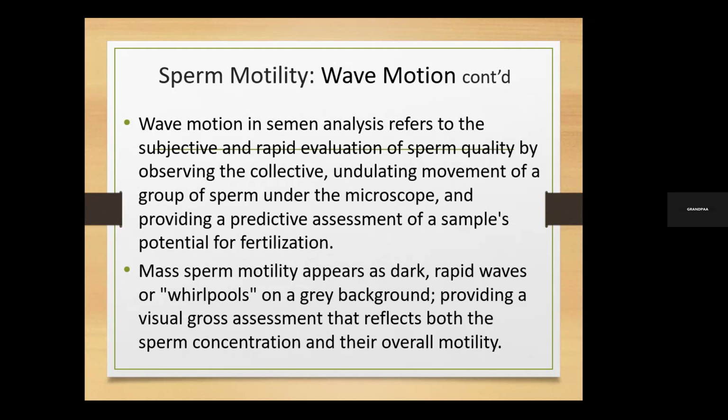Now, the waves are also sometimes called whirlpools. I'm sure you know about whirlpools, where if you drop, let's say, a stone into water, you see that it forms, what do you call it? Some rings begin to form, and then they spread out to make the waves. So that's a whirlpool. So the waves can also appear in that form.